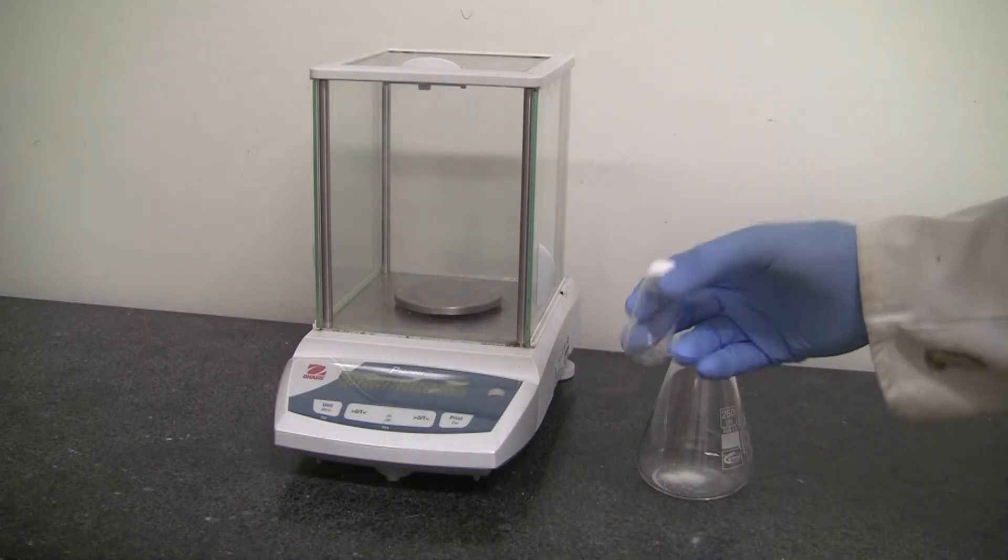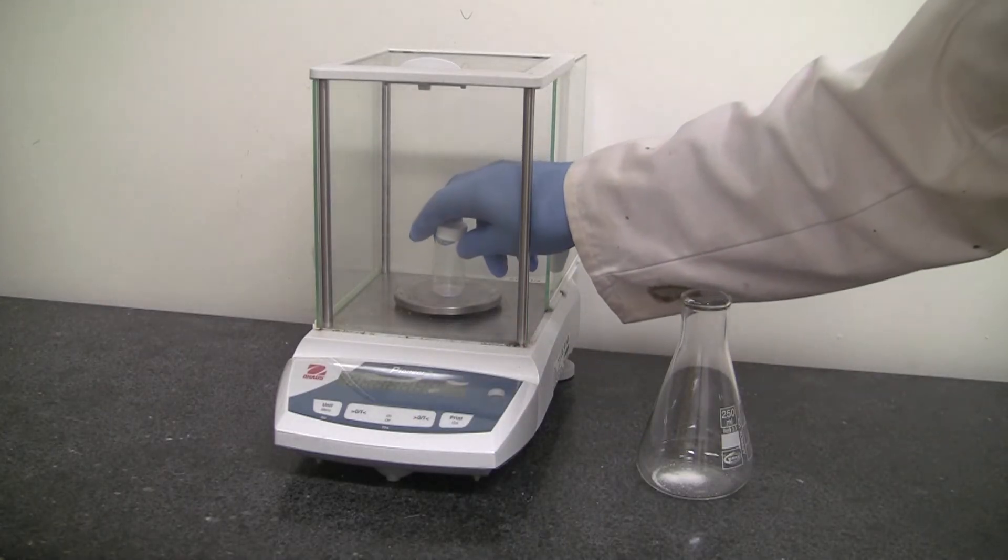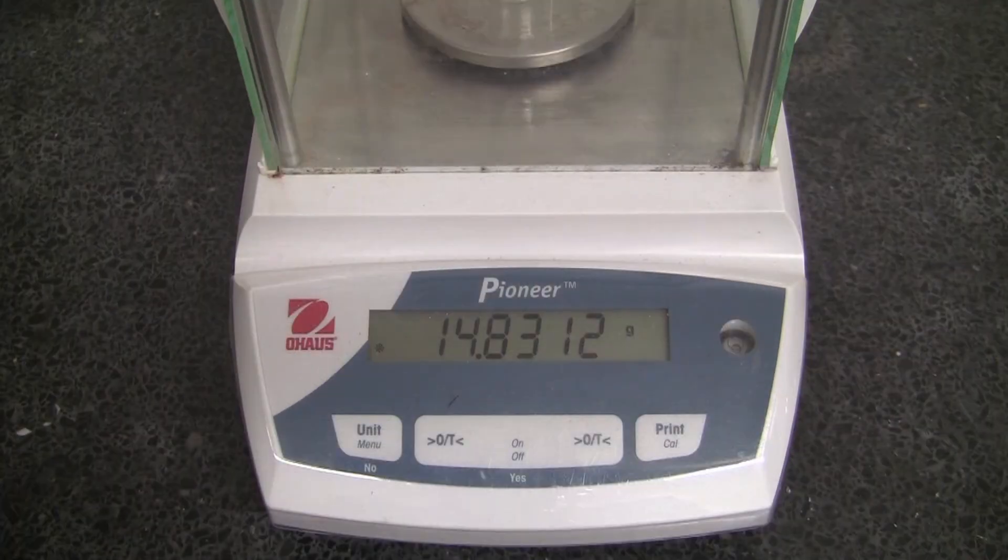Make sure the balance still says zero, place the vial back in, and take the reading again, all four decimal places. This is called weighing by difference.